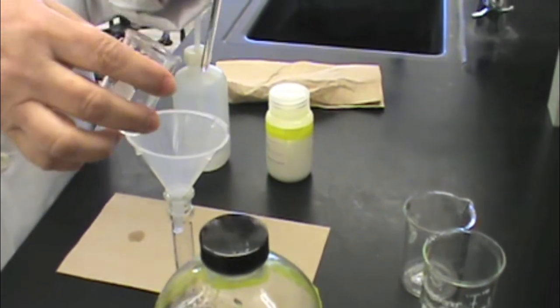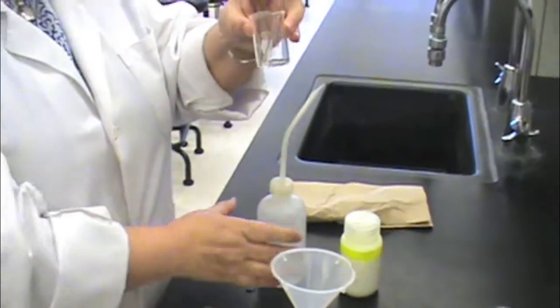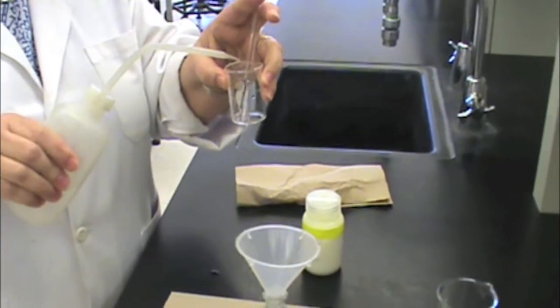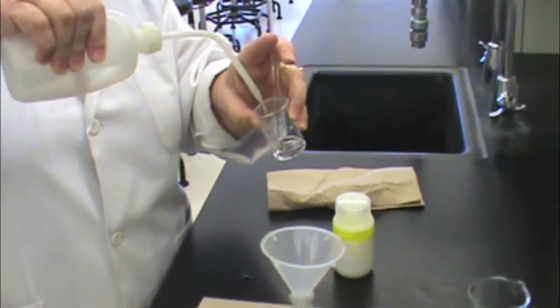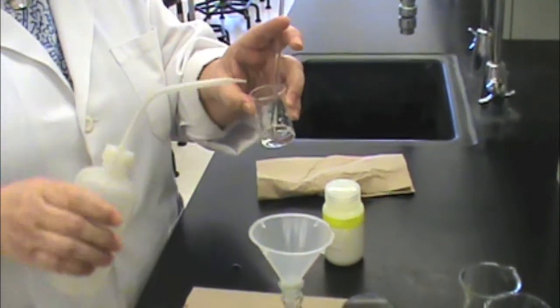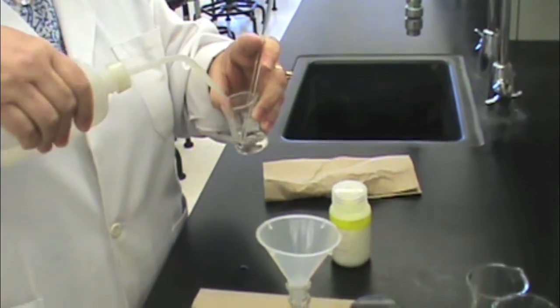Then put the glass stir rod back into the beaker and use your wash bottle to wash the stir rod and the beaker. You will need to rinse the beaker at least three times to make sure that all of your solution has been transferred to your volumetric flask.